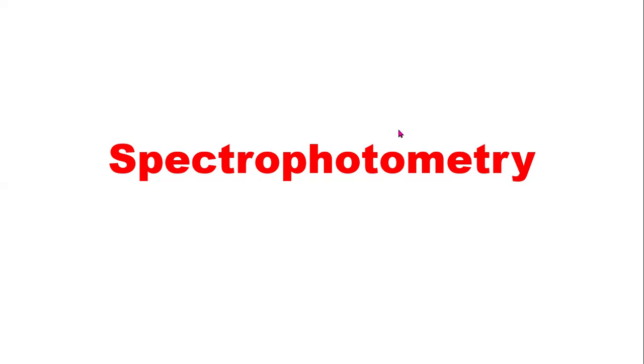In these lectures, we will be explaining the basic principle behind spectrophotometry, and also we are going to answer some exercise questions so that it will aid your understanding of the practicals, as well as guide you on how to report so that you have maximum marks at the end of the day.